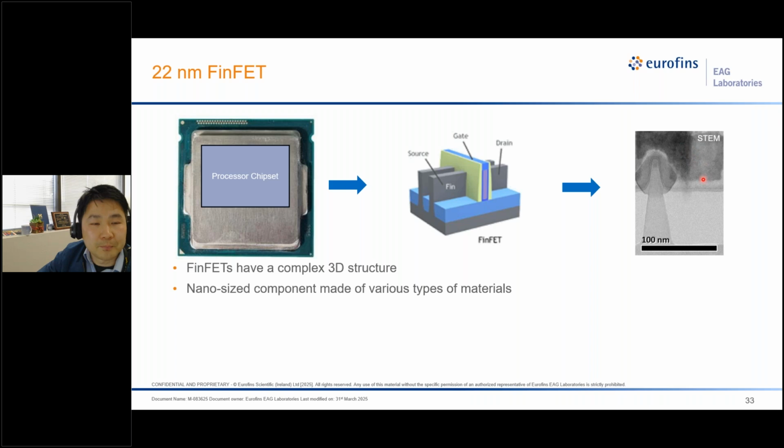In such a structure, the difficulty comes from combining many different materials with different electrical properties or requiring different fields. We have the FinFET silicon, we have the metal gate wrapping on top, and we have the source drain region that could be doped for N-type or P-type regions.